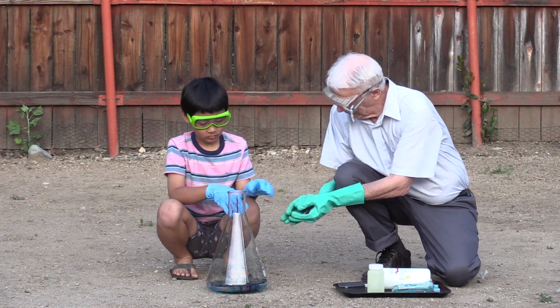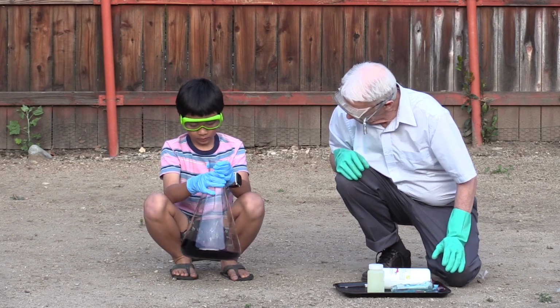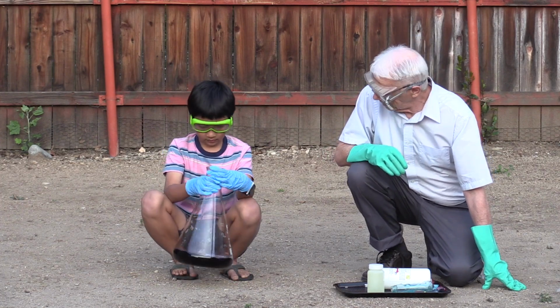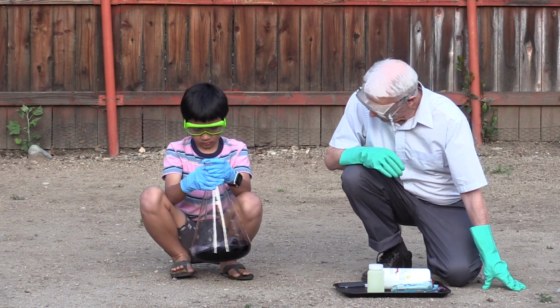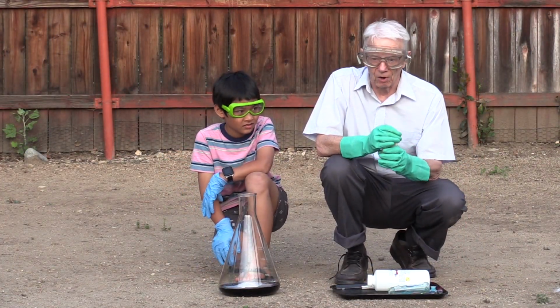Okay. Now, I'll take those. You want to swirl that flask around a little bit for me? Yeah, just swirl it around. There you go. Oh, it is purple. Very nice. We're going to get a purple toothpaste. How neat is that?